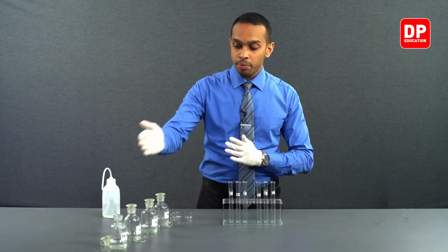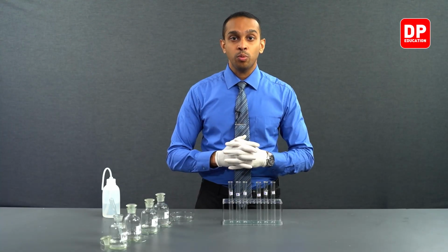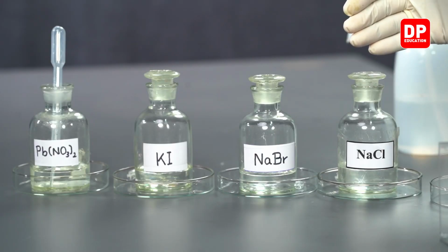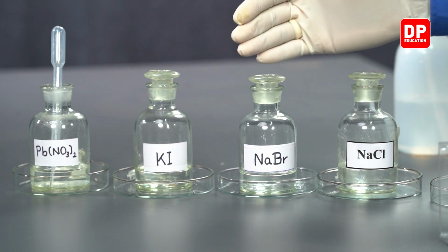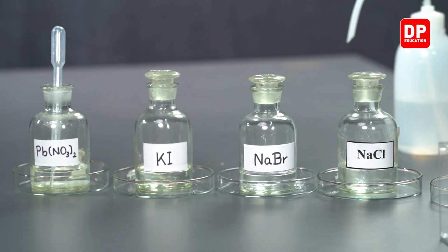Lead nitrate is a water-soluble ionic compound, so it will bring lead ions into the medium without any problem. And each of these salt solutions, sodium chloride, sodium bromide, and potassium iodide, will bring chloride ions, bromide ions, and iodide ions into the medium.